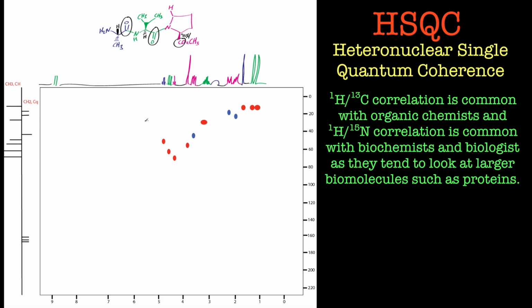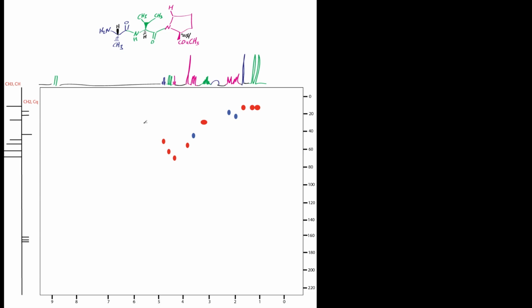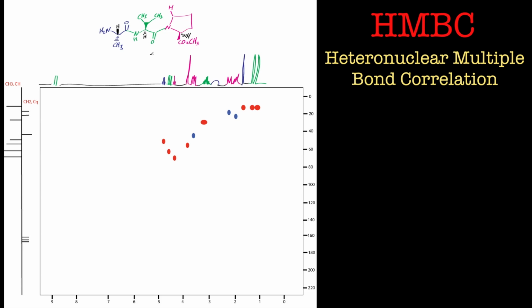So what we're trying to do today with the HMBC NMR spectroscopy tutorial is look at long-range couplings. These are multiple bond correlations between a proton and another carbon, and you'll see that this is really useful for assigning carbonyls, and also connectivities between things like this, where you've got a spin system. In the TOCSY of this, for example, you see that this proton would couple to this proton and to this proton, but then it'd stop because that's the end of the spin system.